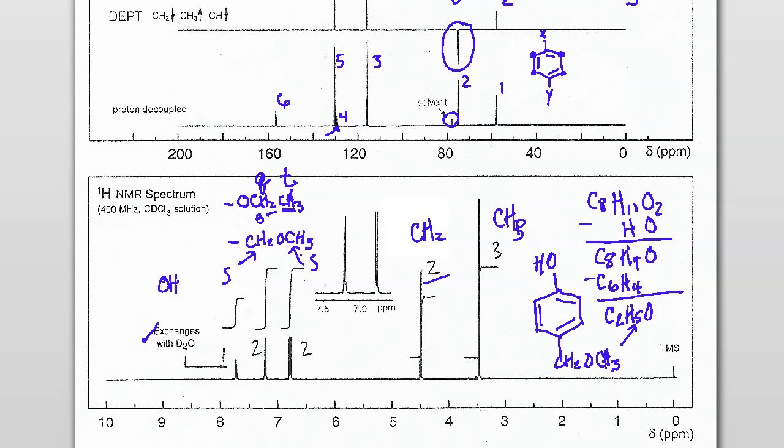So hopefully you've been able to see methodically how we can work through these puzzles, and you get increasing bits of information that you collect as you go along, and they should always be supported by the original information you came up with. So we started with degrees of unsaturation, and every spec that we went through, we continued to build and snowball our evidence until we finally got to the Proton NMR, which was very rich in information using the integration numbers, the splitting patterns, and you tie it all together. That's a lot of support for your unknown structure, and that is how you solve these problems.